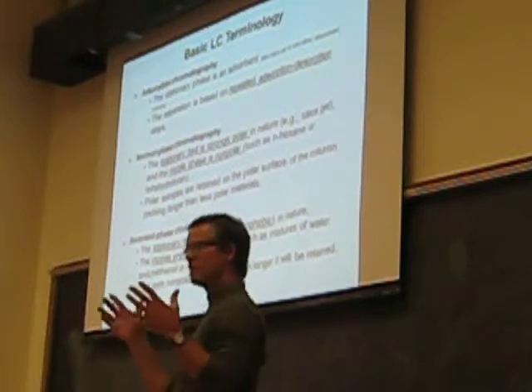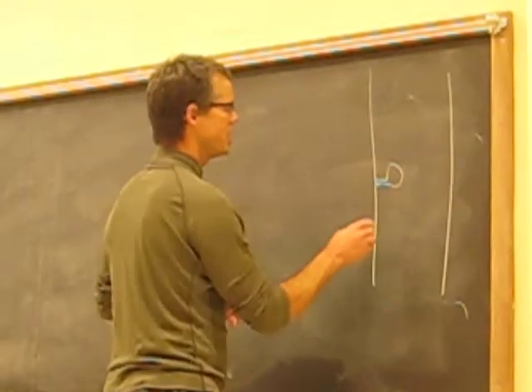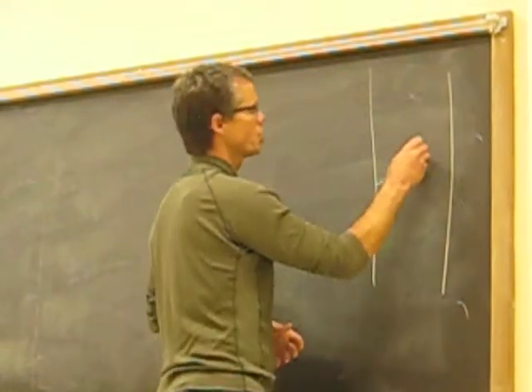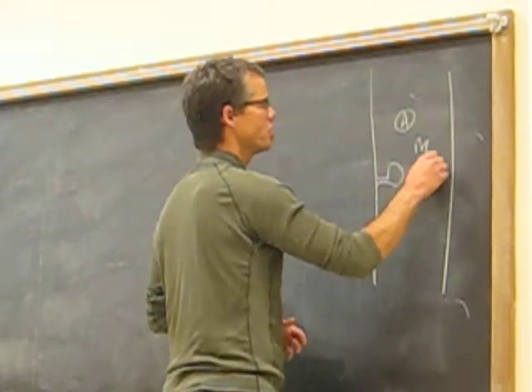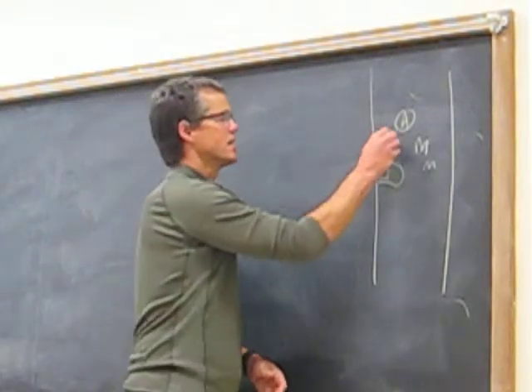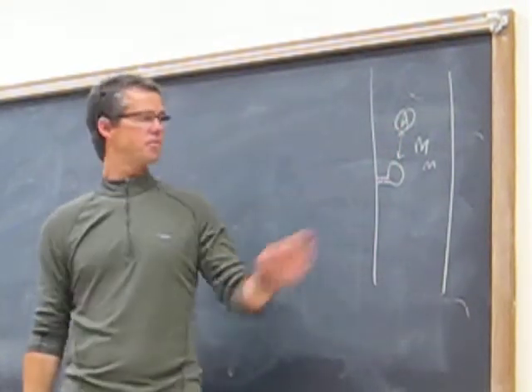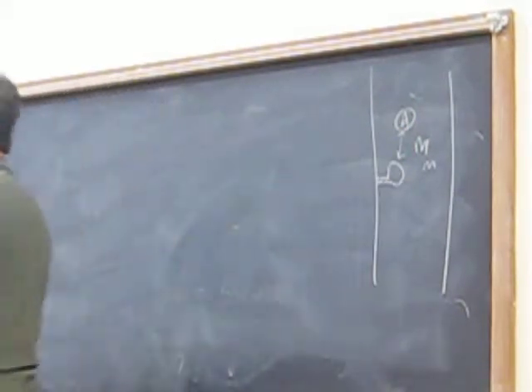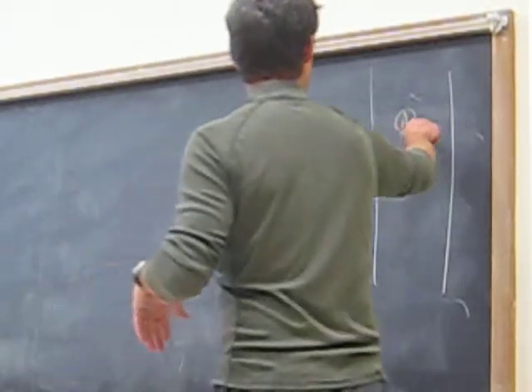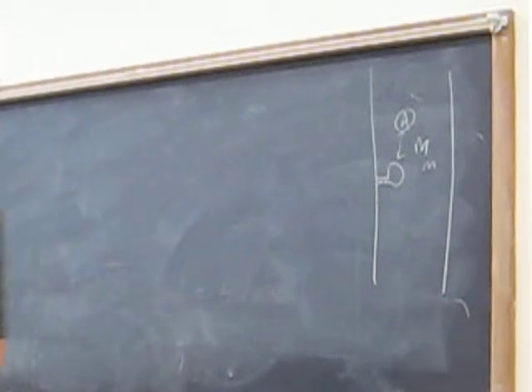And so chromatography, and we've talked about this a lot, is all based on a column, and it's based on the interactions of the stationary phase with the interactions of analytes inside the mobile phase, right? And it's this interaction that is facilitating the separation of this analyte from some other analyte in that column, which is the whole point here. And so if you know the chemical character of your analytes that you're trying to separate, then you can select what might be the most appropriate chromatographic approach.